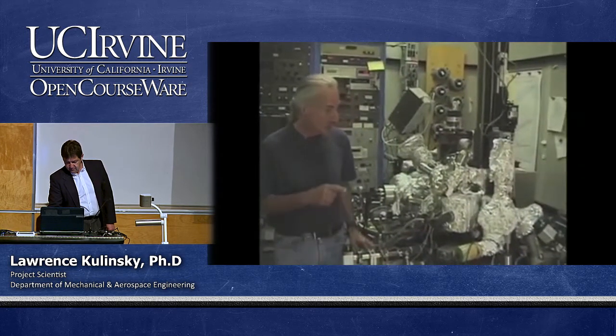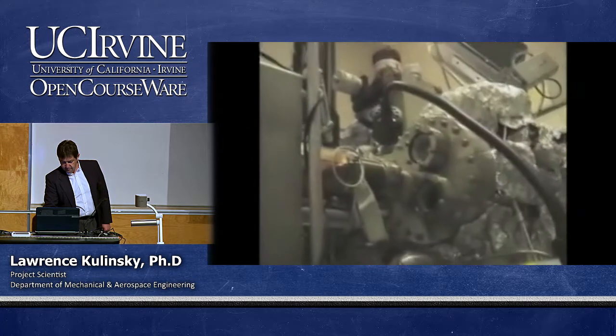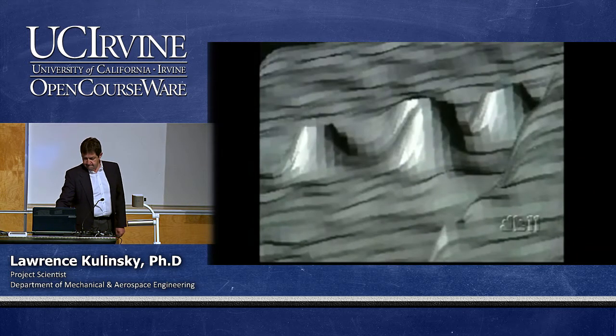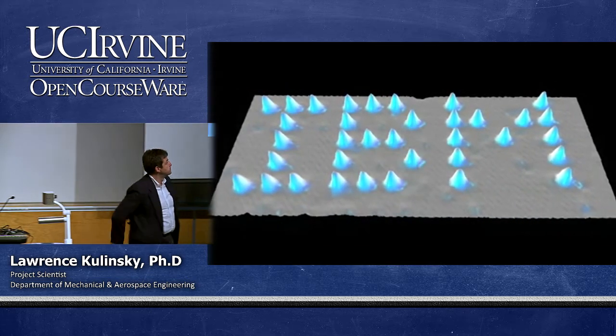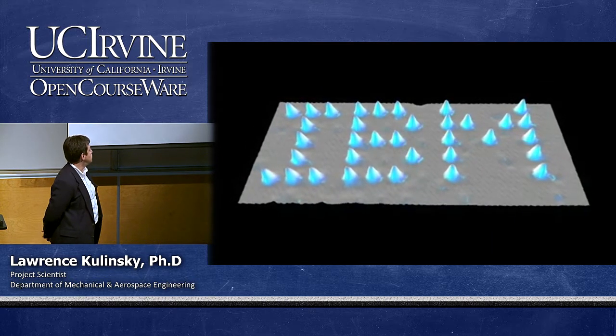Dr. Eigler built his scanning tunneling microscope in order to visualize and experiment with individual atoms and molecules. As he experimented, he discovered that it was possible to slide individual atoms and move them using the tip of his microscope. To demonstrate this ability, he created the world's tiniest IBM logo, made from 35 xenon atoms.